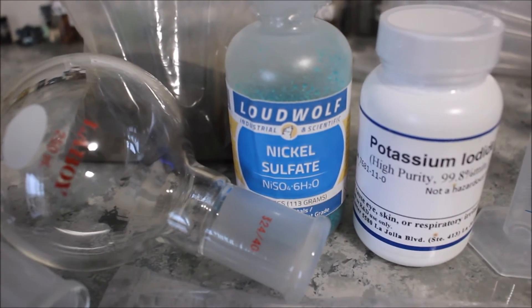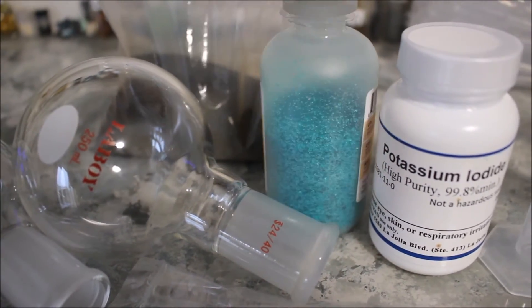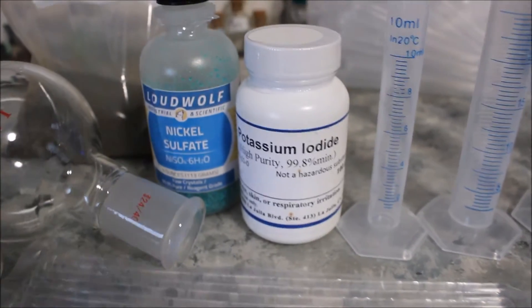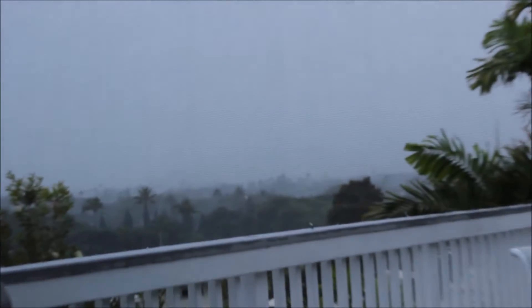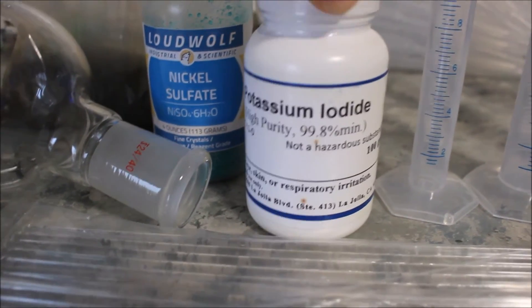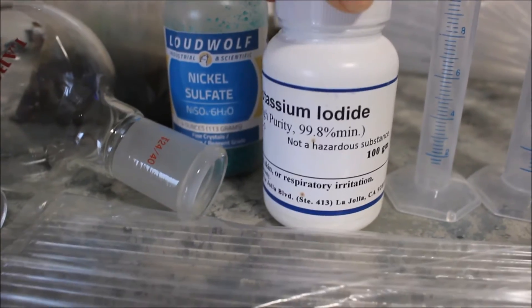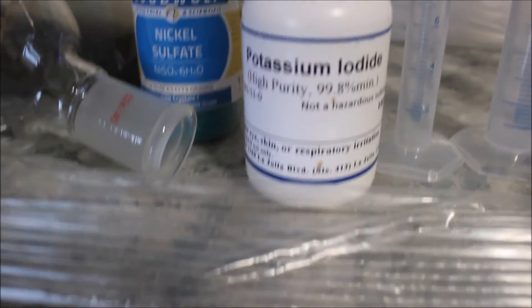Next, nickel sulfate — you've already seen this in action. I got 113 grams of it. It's a blue-green crystalline ionic compound. Next, potassium iodide — this is also going to be used in some upcoming videos. I haven't taken off the seal yet because it's super humid outside right now. I'm gonna make iodine from that. I got 100 grams of it — it wasn't that expensive, I think it was like $13. It's easier to make iodine from potassium iodide than to order iodine directly, and potassium iodide can be used in a lot of reactions.